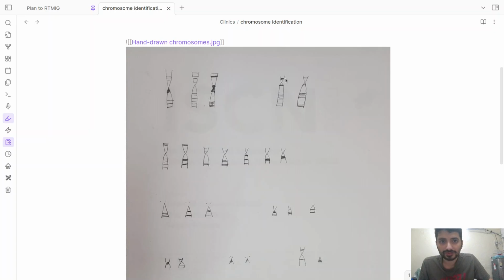So what gives chromosome 4 away is its submetacentric nature with a size that is almost comparable to the group A chromosomes. And it has these two dark bands, one in the P arm and one immediately distal to the centromere on the Q arm. And this is called the shoulder band. It might have several other bands as well, but these two are the important ones for identification.